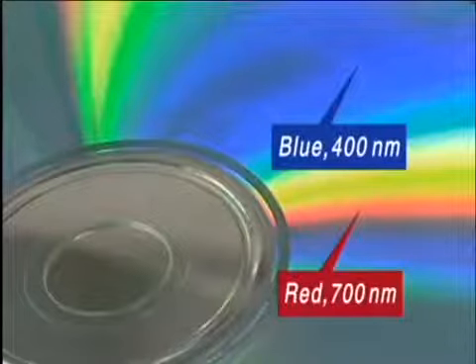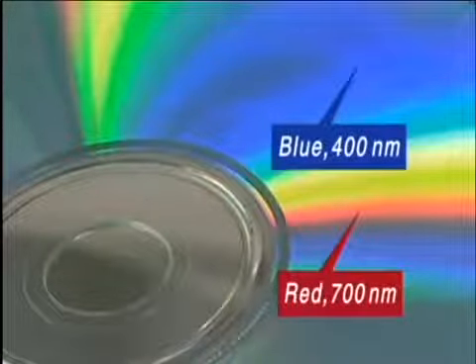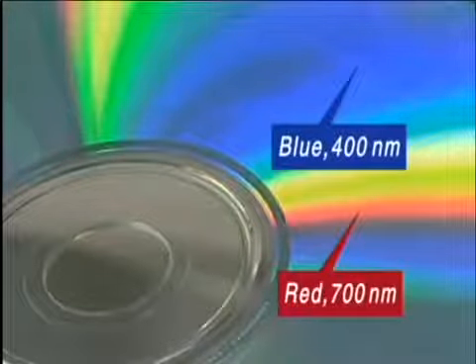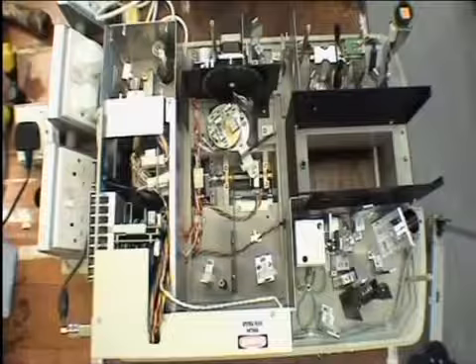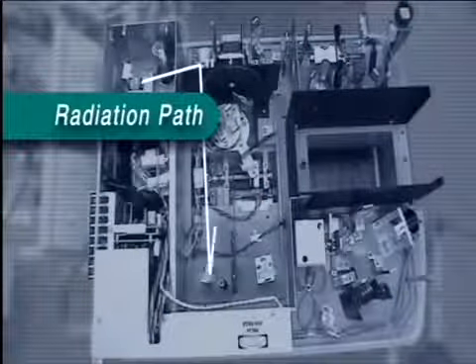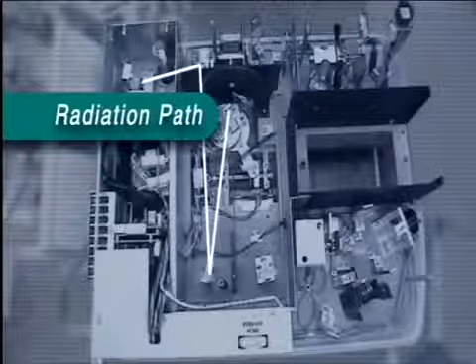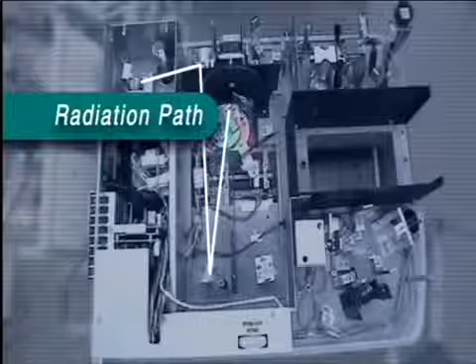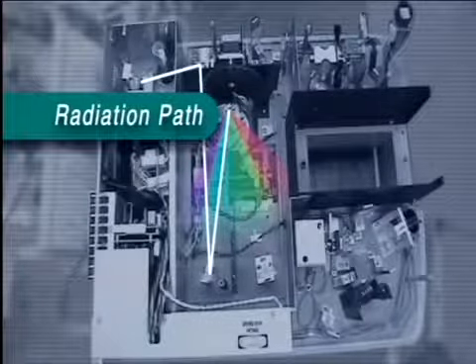Wavelengths shorter than about 350 nanometers are called ultraviolet. Shorter wavelength light has higher energy. The source produces white light that includes all wavelengths, all colours. The instrument scans through the spectrum, sending different wavelengths of light through the sample in sequence.